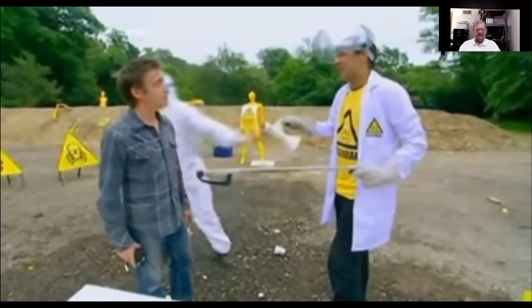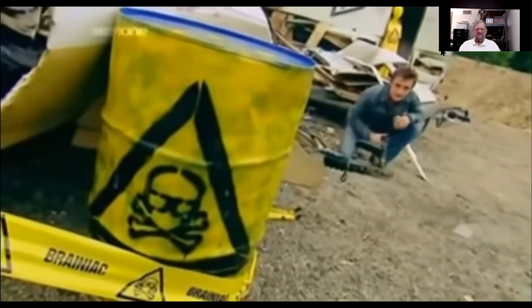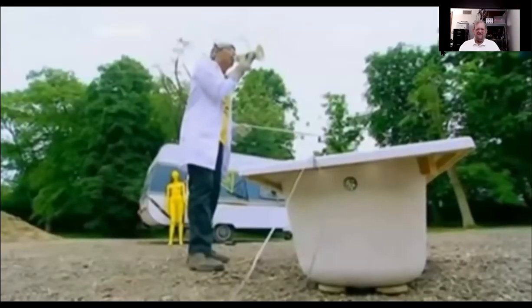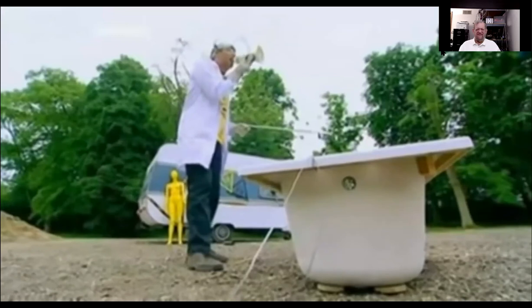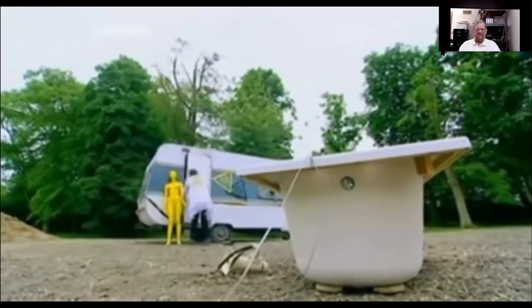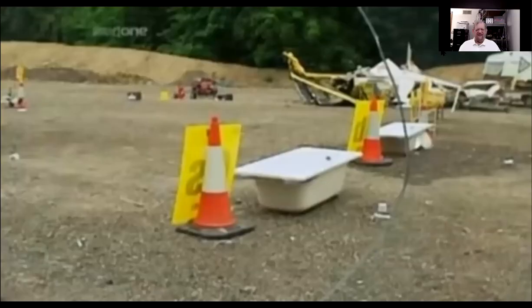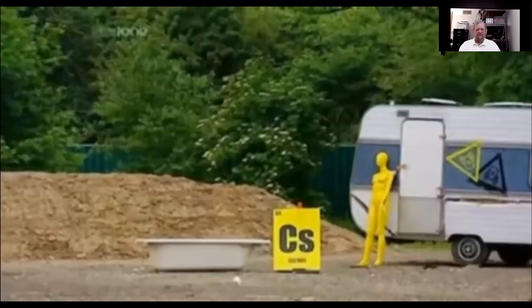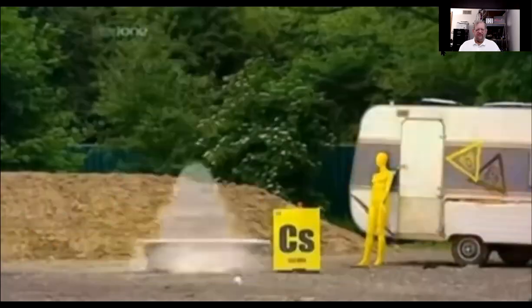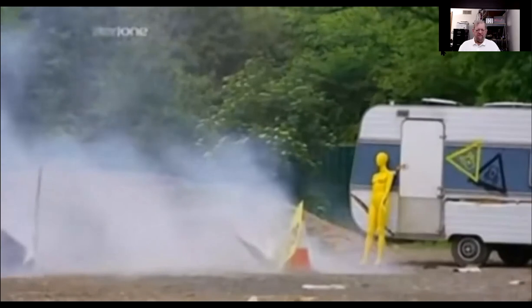Now, what's that going to do when it hits the water? Imagine a depth charge in the bathtub. Right, mate, I'll leave you. Good luck. Thank you. Okay, Tom, go for it. Warning, extreme danger, clear the air. As our cesium sinks in the water, the rapid generation of hydrogen gas should produce quite an explosion. It does.